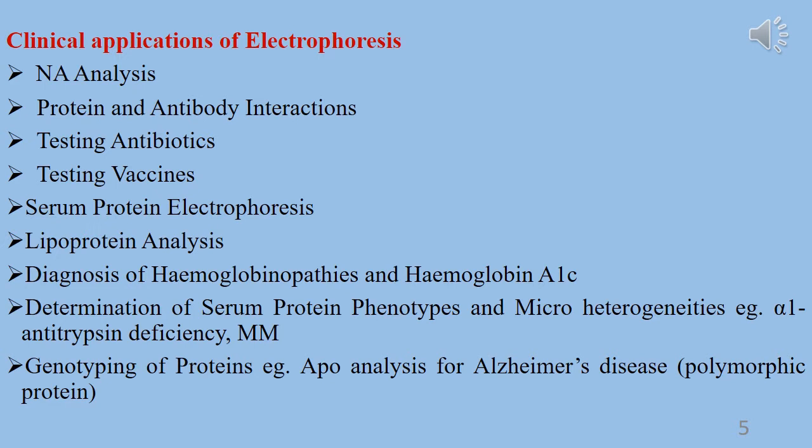Another application is testing vaccines. Electrophoresis is useful in both the creation and production of vaccines. The purpose of a vaccine is to help the body generate antibodies to potentially dangerous pathogens, and electrophoresis is a useful method for detecting those antibodies. It can be used to compare the effect of a vaccine or multiple versions of a vaccine across a large number of test subjects or other variables. Once the vaccine is in production, electrophoresis also provides a quick and effective way of testing production batch-wise.